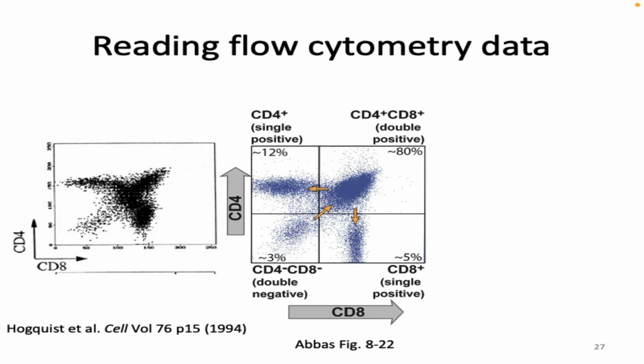As I mentioned, I have one more thing I want to tell you about flow cytometry, and then I'm just going to give you the problems. And you can work through all of the part 1 problems. You know what you need to know. I'm happy to help you with them as much as you want. The part 2 is going to be based on the data that you generate next week when you do cytometry.